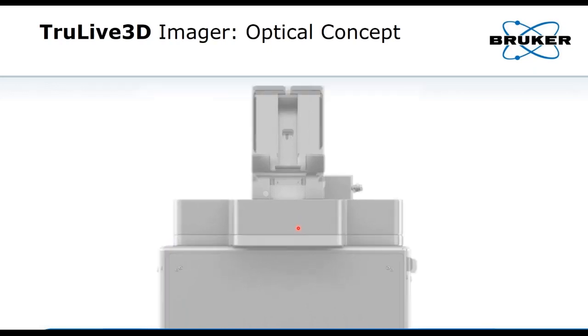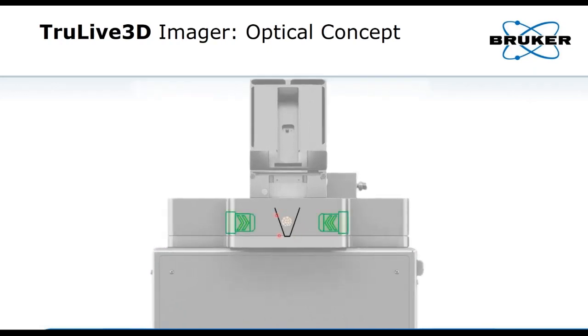Conceptually, we have our object again in a sample holder based on FEP foil, but we are now illuminating from two sides instead of one, and we're detecting the fluorescence signal again with a 25x 1.1 NA lens from below. This can be operated like in the InVi SPIM at about 30x and 60x magnification for either overview imaging or high, properly oversampled, high-resolution imaging.